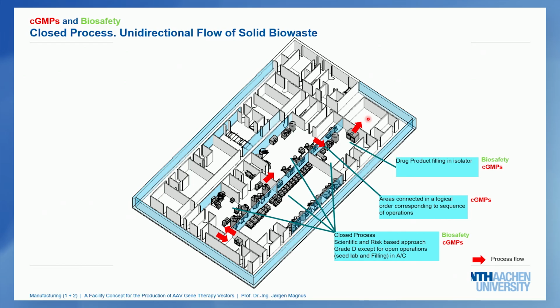The isolator, as mentioned, is closed and has a level A inside it. And that's okay because it's an isolator, and therefore the grade C in the production room is enough to provide a level A inside the isolator.